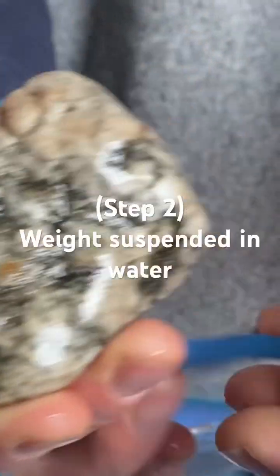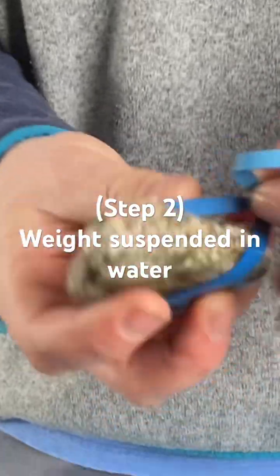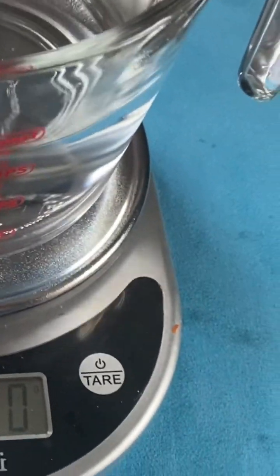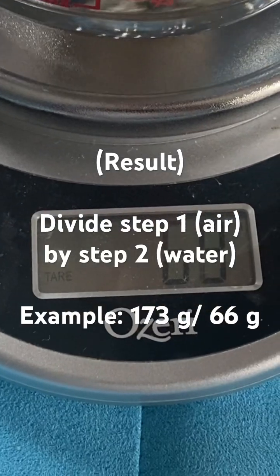We have to go like this — we have to suspend it in water and see how much it weighs when it's suspended in water. Okay, go ahead. Touching bottom — that's good, right there. 69 grams.